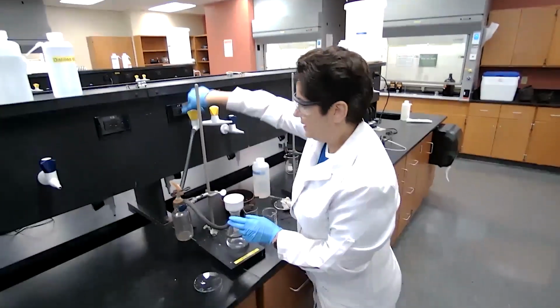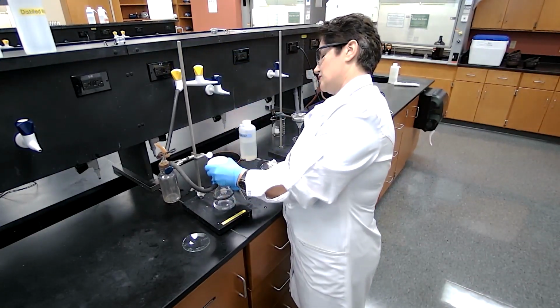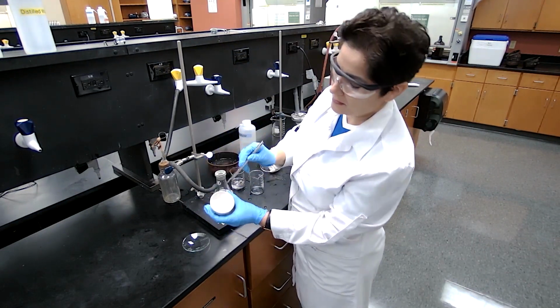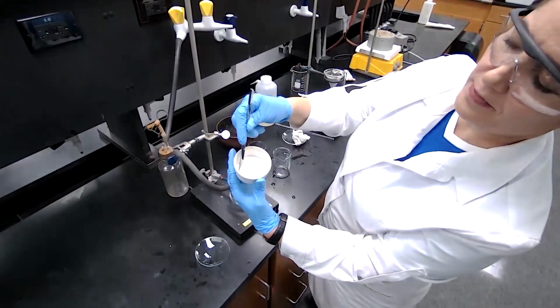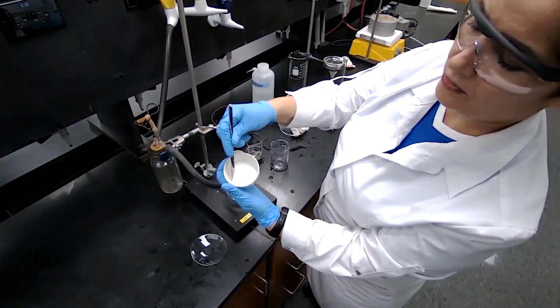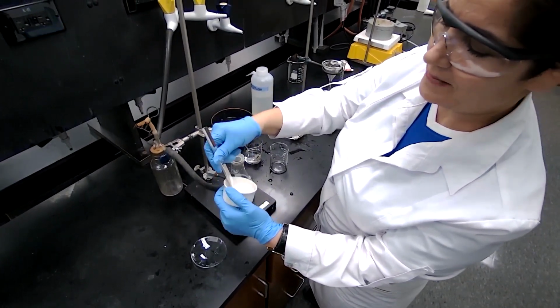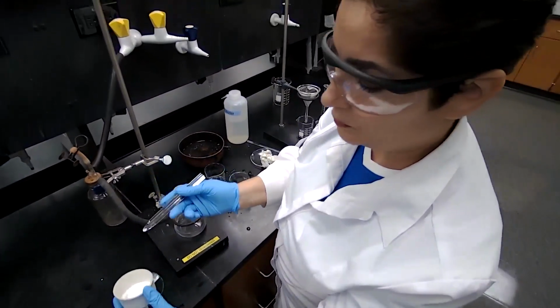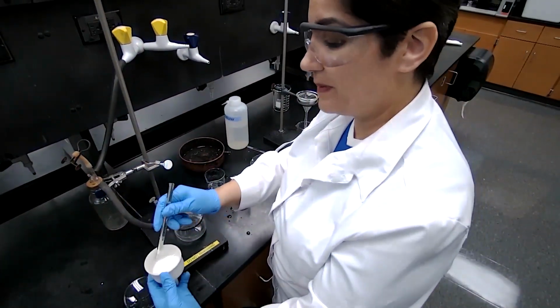Okay, the 5 minutes of vacuum filtration is up. I'm going to remove the Buchner funnel and transfer the crystals into the watch glass. Often students ask how to do that. It's the same thing as when you are baking a cake. Sometimes you just flip it over and flip the crystals out with the filter paper.